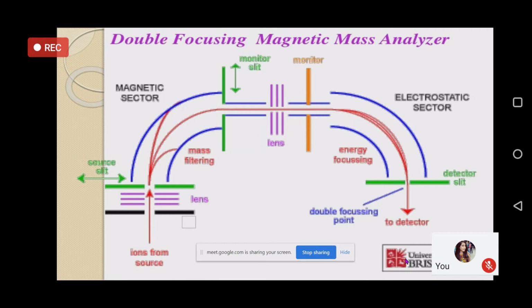When you take gas molecules, all the gas molecules move with different velocities, and there is a distribution. There is always a velocity which is called the most probable velocity, for which the number of molecules having that velocity is highest, or maximum. All of you can recollect the Maxwell-Boltzmann distribution of velocities, which is an inverted parabola.